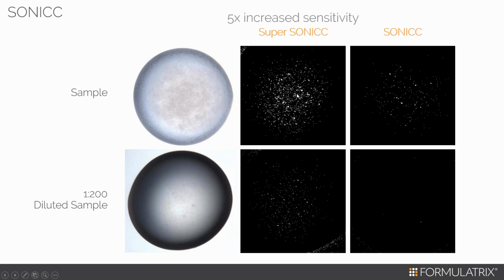So now this can benefit you in two ways. You can either increase the sensitivity by keeping the exposure time the same, or if you are a really high throughput lab and exposure time is critical to you, then you can reduce the exposure time but keep the sensitivity the same. So to each his own.